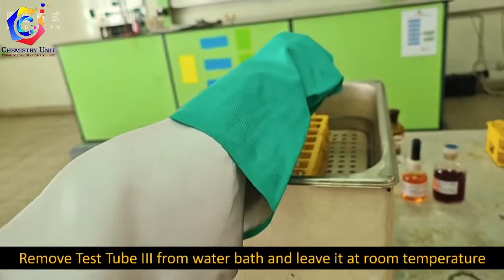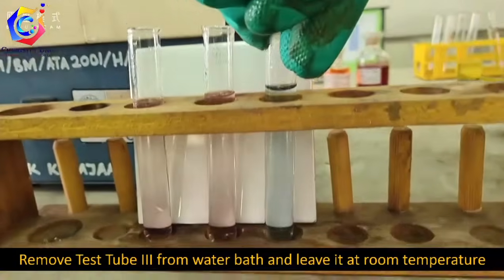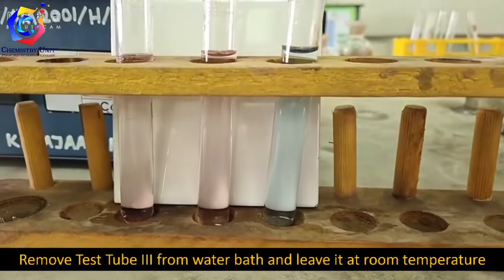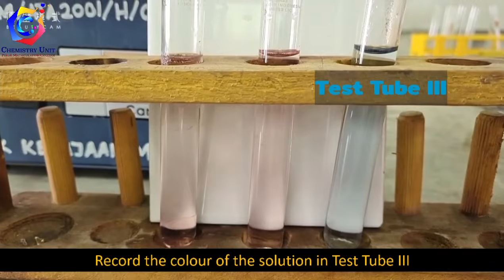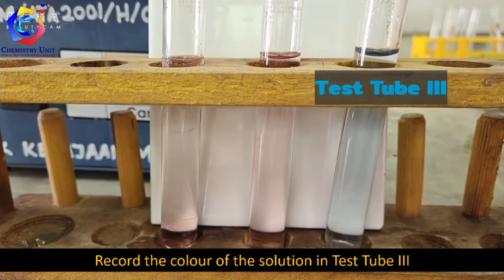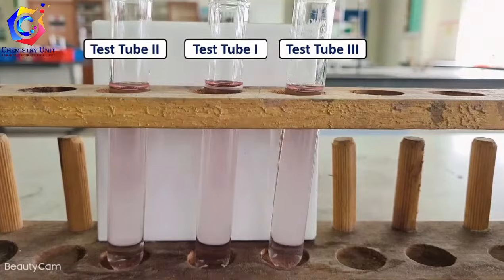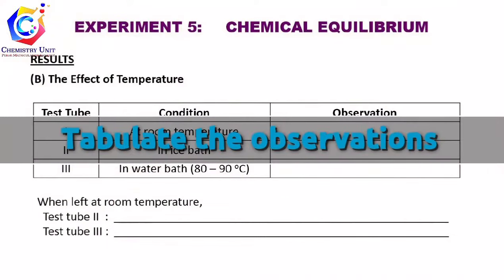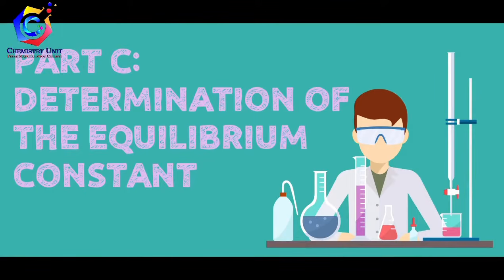Next, remove test tube 3 from the water bath and leave it at room temperature. Record the color of the solution in test tube 3. Leave the test tubes at room temperature and tabulate the observations. And now part C.